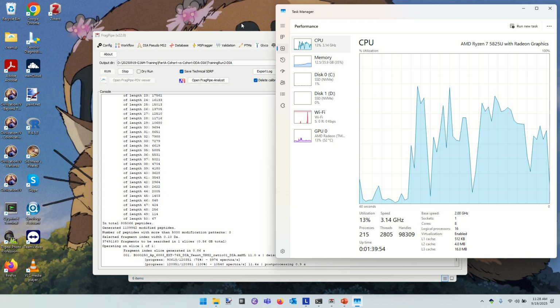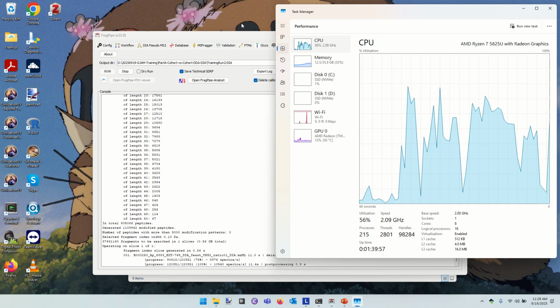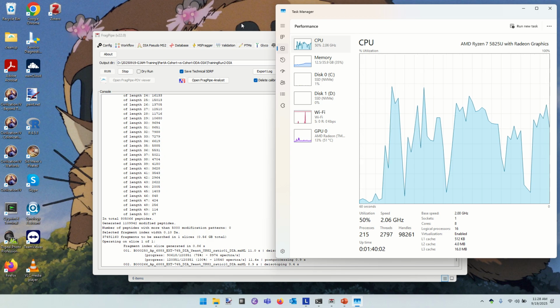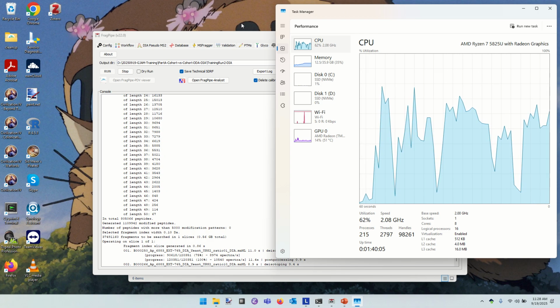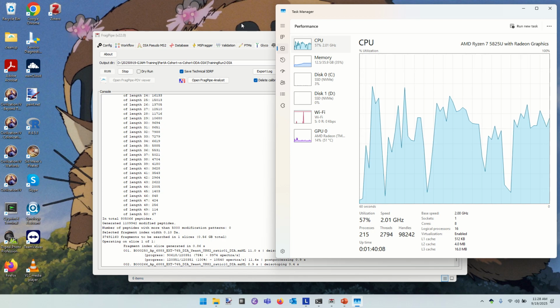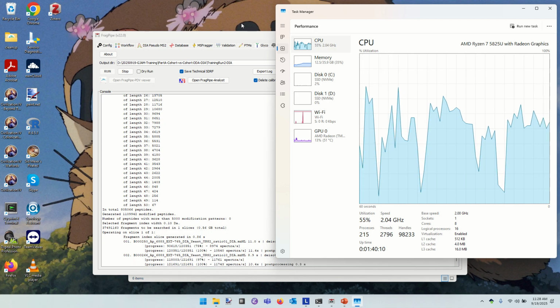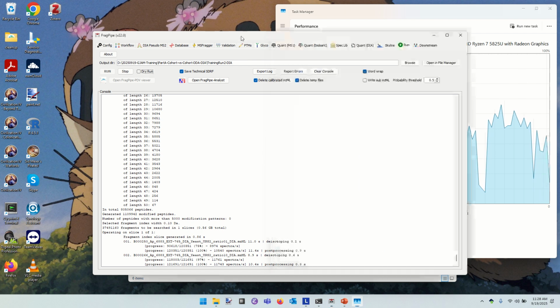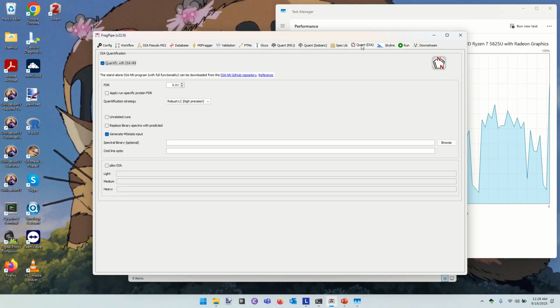Yeah. But it seems like a very obvious thing that must be turned on. I'd be surprised if it fails to do that. Yeah, it's just that if it's turned on by default, then there's no way to turn it off. There is not a button that says MBR in the DIA-NN quantification window. But there is a command line options line. Yes. Where you could put, in DIA-NN I think it's called reanalyze. Yes. So you could put that in, and then it would do MBR. But if you don't put it in, it won't. And so if it's already on by default, there's no way to turn it off.